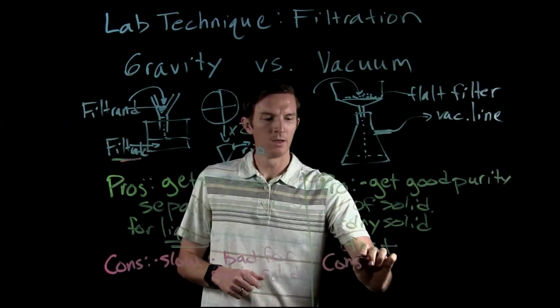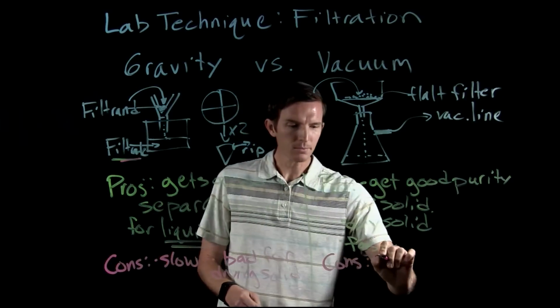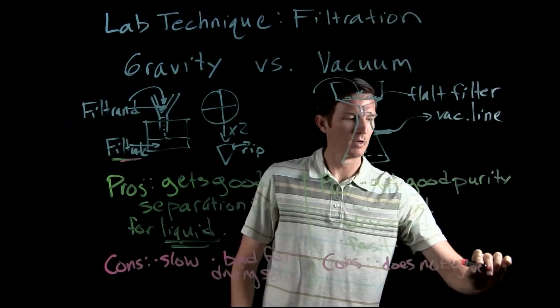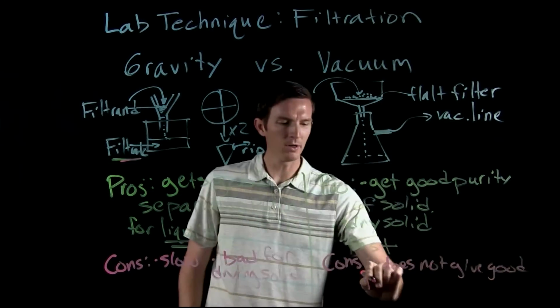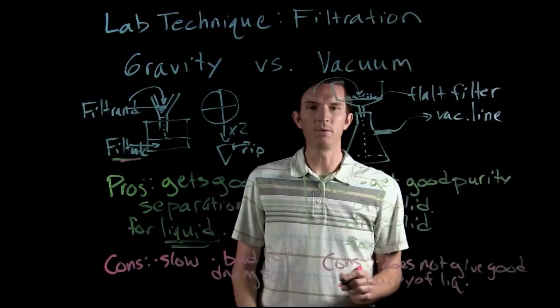Now, what would be the cons when we're dealing with vacuum filtration? This does not give good purity of the liquid.